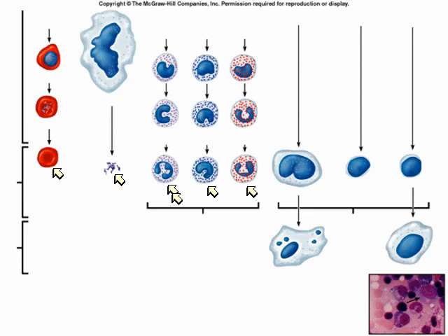That's why they're called neutrophils, and that's why they don't pick up much color with the stain that's used for blood slides. Of these three, the neutrophils, then the one I've got 4 arrows on, this is a basophil. Basophils have granules that are alkaline or basic. That's why they're called basophils. But these stains stain those basic granules a bluish color, in fact, a pretty dark blue.